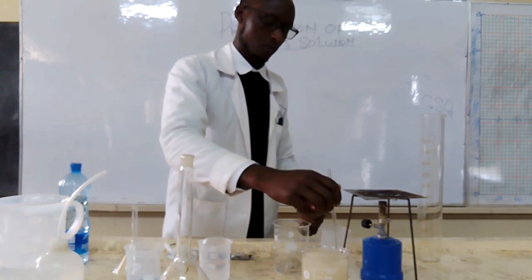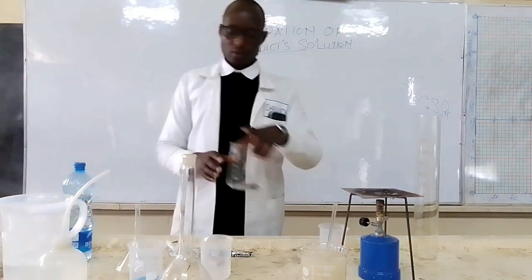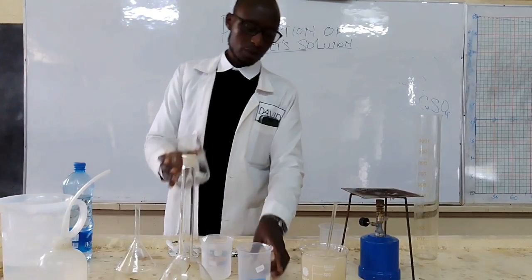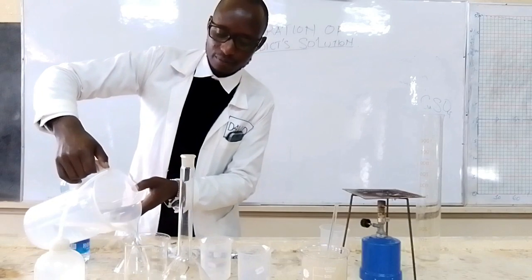So that's it. So I'll also prepare a separate solution of copper 2 sulfate. I may need some more boiling water.